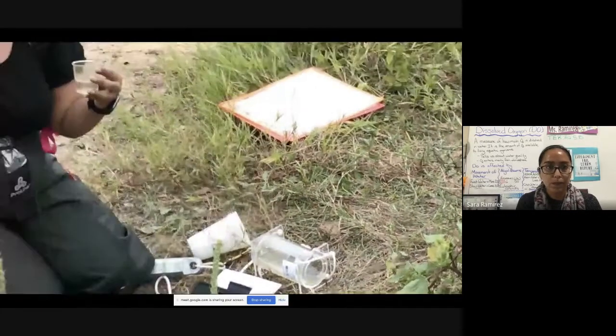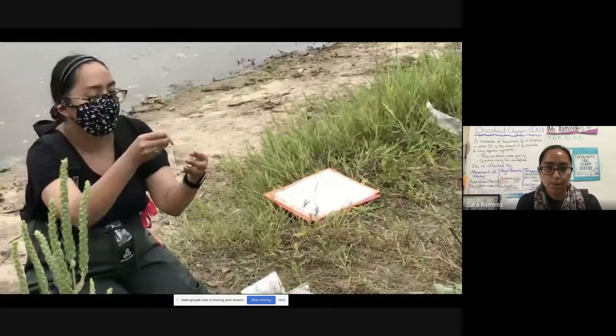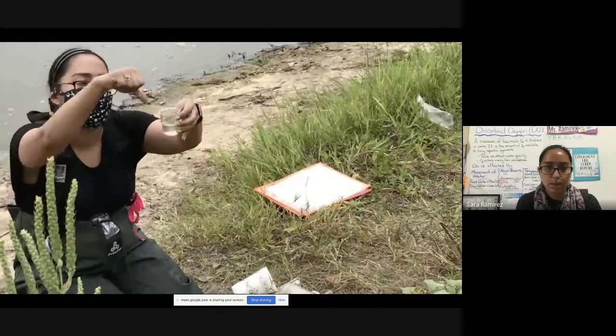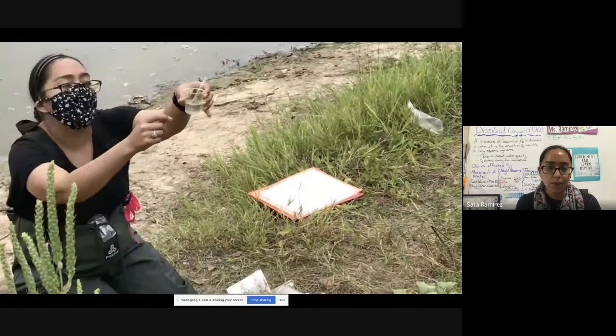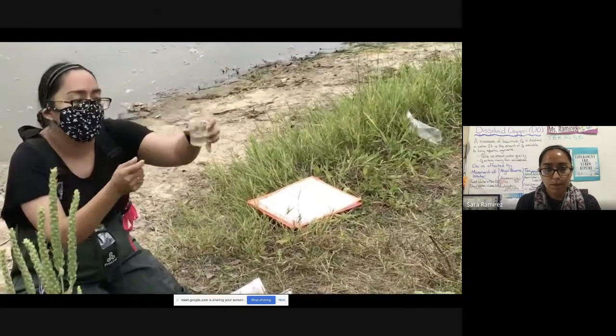I'm going to take one of these glass ampules. There's a chemical inside that reacts to oxygen. I'm just going to put the ampule inside the beaker and I'm going to take my thumb and I'm just going to press down on it. My goal is to break the ampule tip. That way some of our water sample will be injected into the ampule itself.